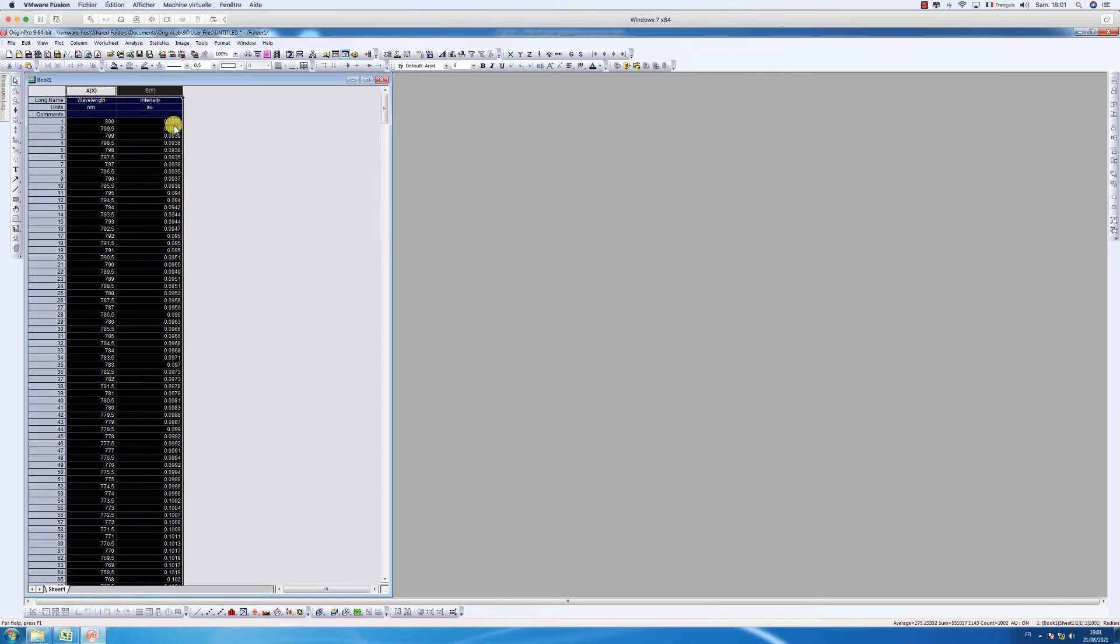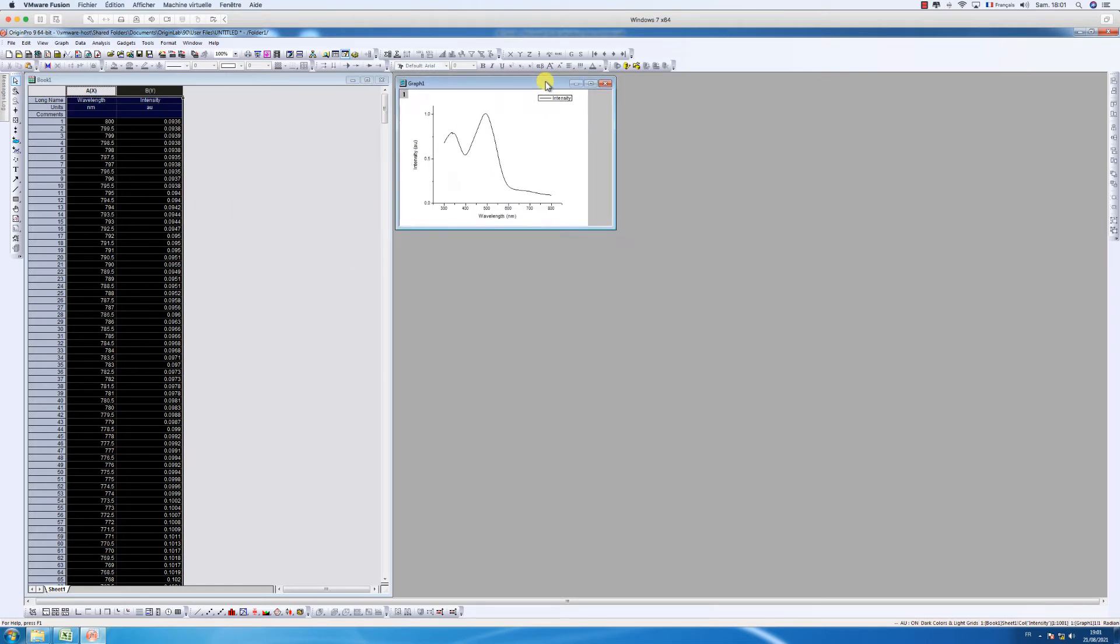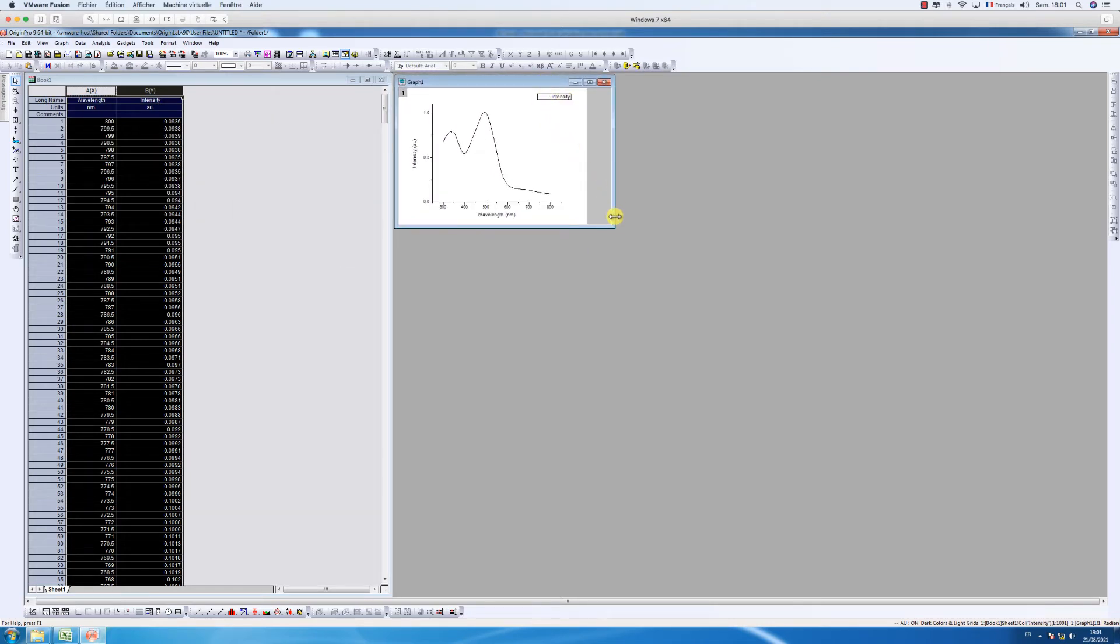And then select x and y both of them and try to click on plot and then line to plot your graph.